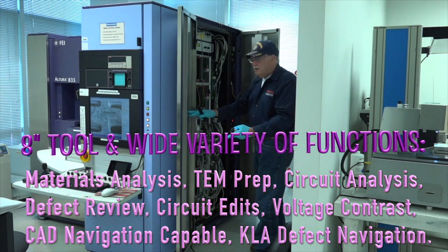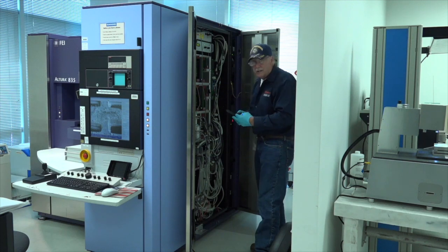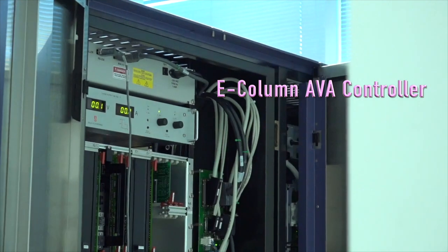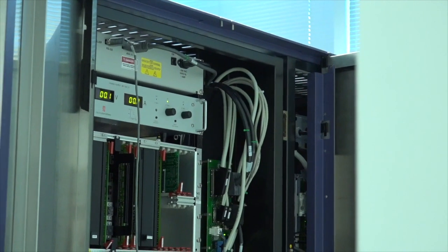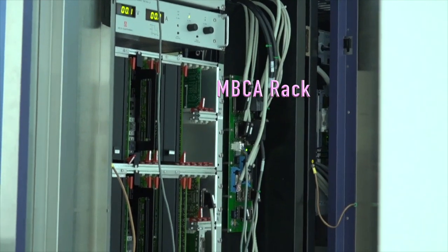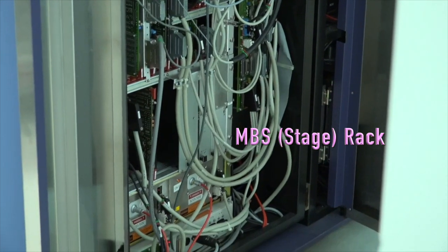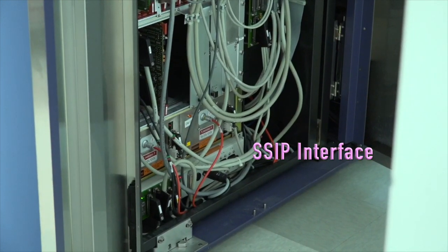That exposes the electronics. This is the electronics rack. The very top of the rack is what we call the AVA controller — that's the box that controls the aperture strip in the E column. Right below that is a UHR delta power supply. Then we have multiple electronics racks: one, two, three, four, five racks plus the IGP power supplies, and then an interface box below that.